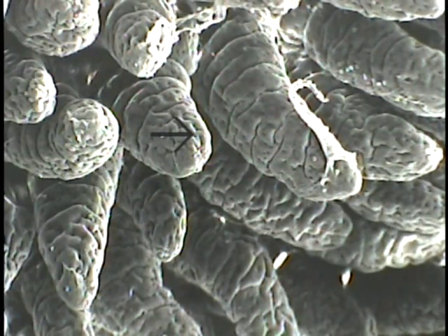This is a scanning electron micrograph of the mucosal surface, demonstrating the villi lining the jejunal segment of a small intestine. So the villi showing here are the tops of them sticking out and projecting towards the viewer. This little region here illustrates a strand of mucin or glycoprotein on one of the villus tops. Again, this mucosal sample was from a human individual operated on for bypass surgery in the hope of correcting obesity.